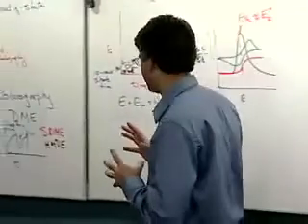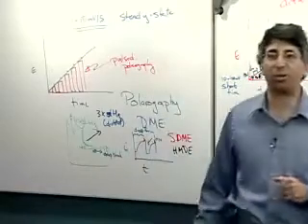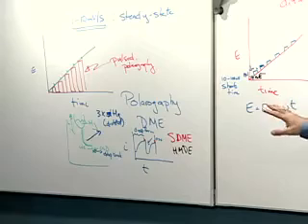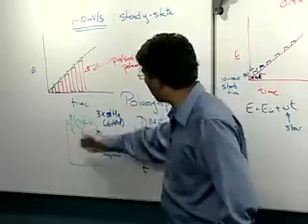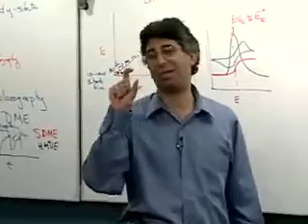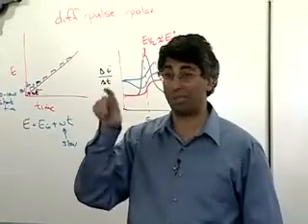Number two is, today, really it's only come out in the last 20 years or so, there is a more sophisticated way of generating these mercury drops. What's done is you can buy a system which pressurizes the mercury reservoir. So there's no more of this lifting or drop knocking business, but it pressurizes it with a little relay piston system that generates a pulse.